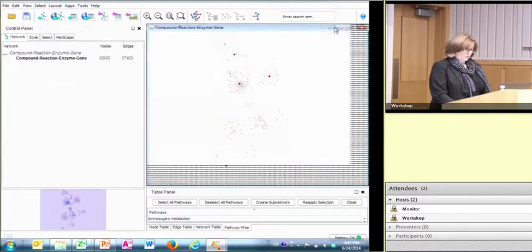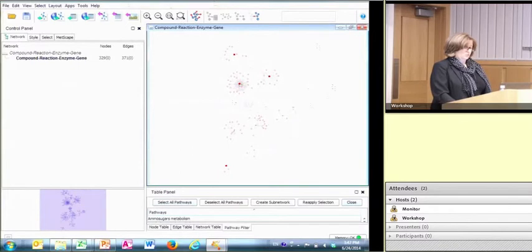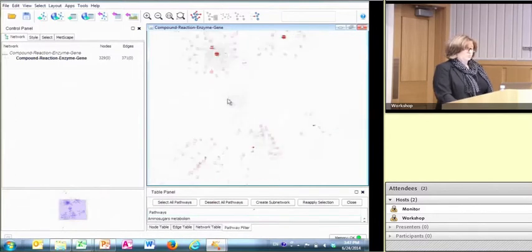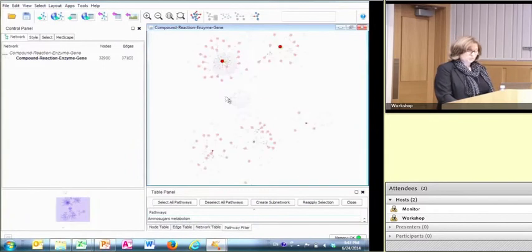So here's our network. As you can see, this window was black before. Now it got populated. As for things that you can do here, if you're not familiar with Cytoscape, the first thing you want to do is ask, what are those small things there?